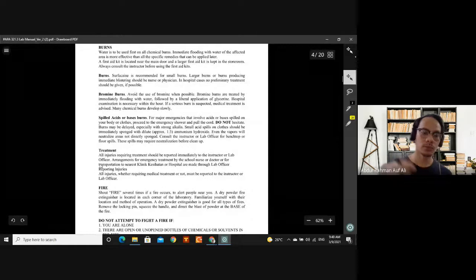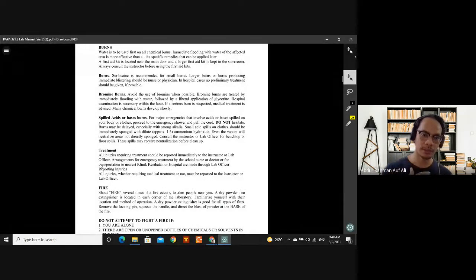The same applies to tudung lah. Okay, tudung you must pin to your dress ataupun masukkan dalam lab coat supaya dia tidak mengganggu, tak tergantung, tak mengganggu movements.